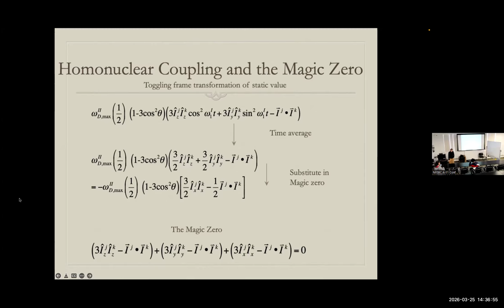Yes, that's true. But then you run into a different aspect that has, I think, been intriguing to people and remains more unsolved than solved, which is that we're dealing with a quasi-infinite bath of protons. And our intuition and our formal expressions all come from isolated spin pairs. And do they really recouple? And where do you leave reversibility?